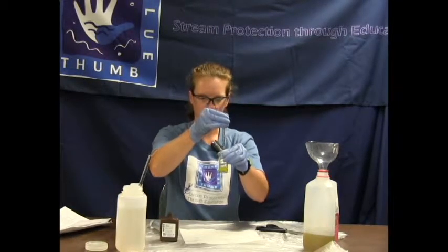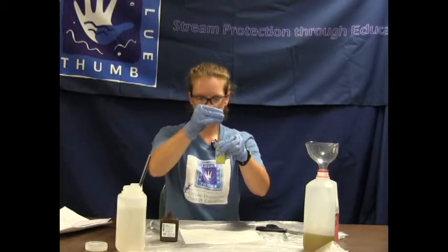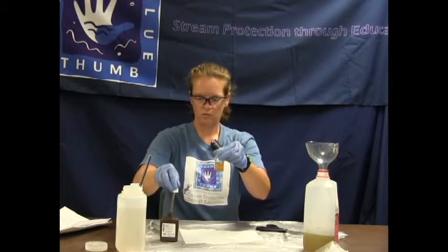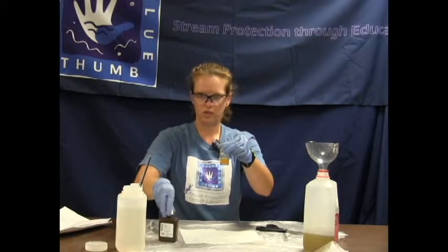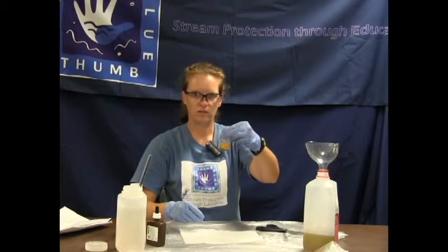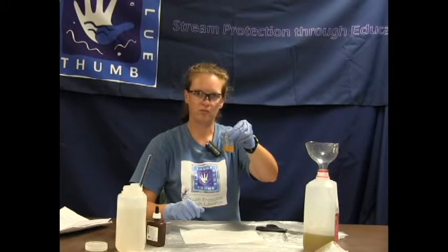We will titrate with our silver nitrate: 1, 2, 3, 4, 5, and 6. We get our color change that stays. So we have duplicated our first test — we had 6 drops the first time, and we also have 6 here. Our second test also equals 120 milligrams per liter. You can't beat coming up with the same answer — that is definitely really good repeatability.